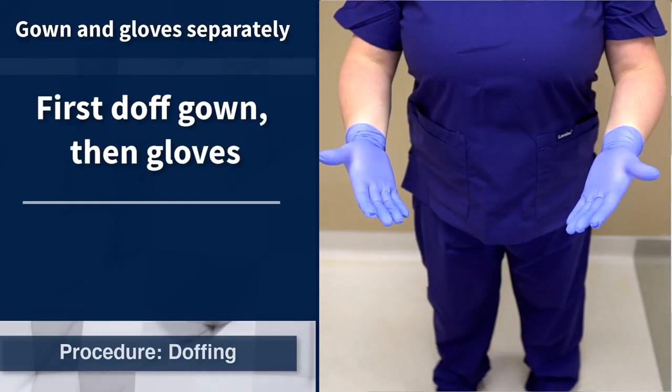Another method for gown and glove removal is to remove them separately, first the gown and then the gloves. This method might be preferable if a gown without thumb holes is being used. This method will prevent contamination from gown sleeves to the healthcare worker's unprotected hands if the gloves were to be removed first. Prior to removing gloves, the healthcare worker should perform hand hygiene on the gloves and remove them safely.